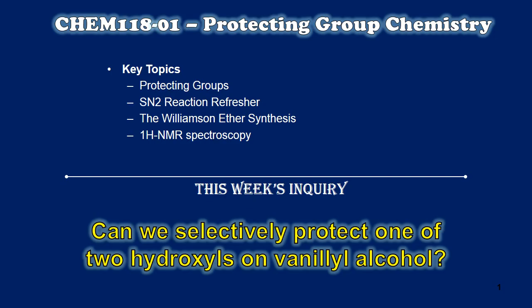Then we'll get a little refresher on how SN2 reactions work, because we're going to conduct a Williamson ether synthesis in laboratory to apply a protecting group to a very specific molecule to achieve a very specific goal. We'll also have a little refresher on proton NMR spectroscopy, because we'll be using this technique as an identification tool.